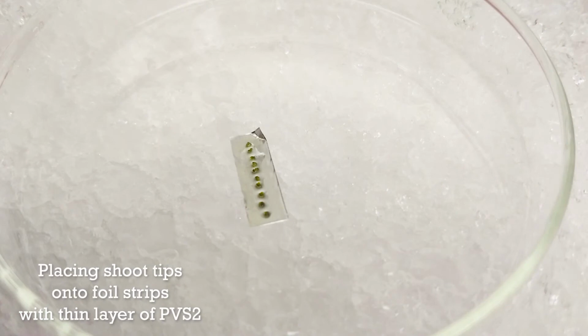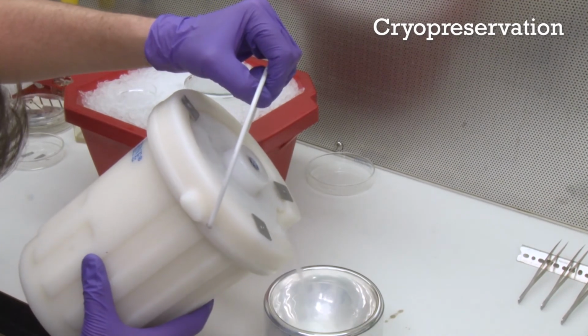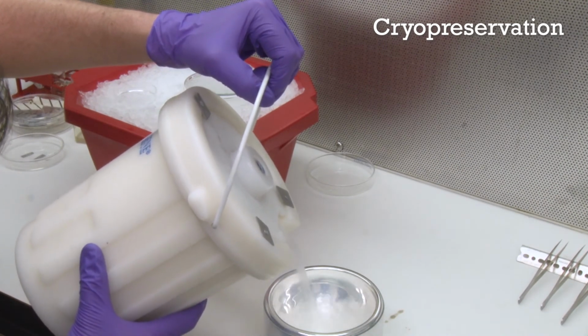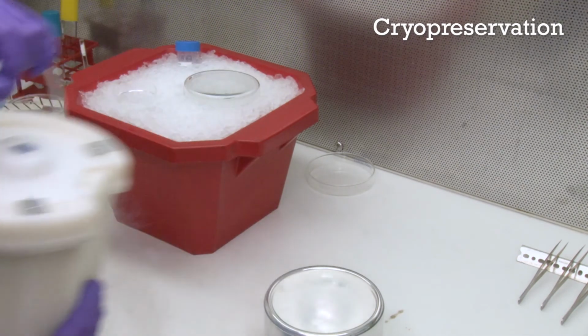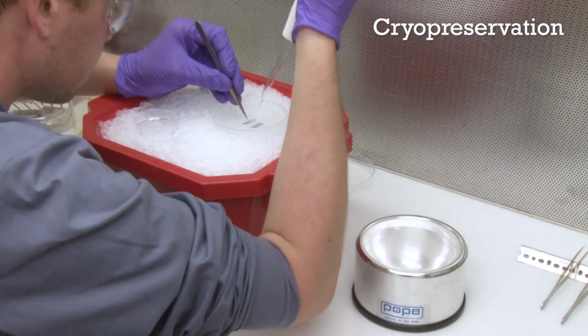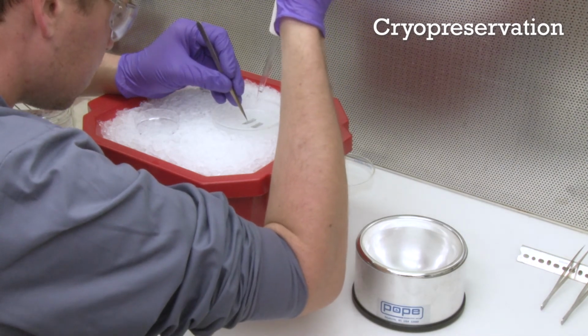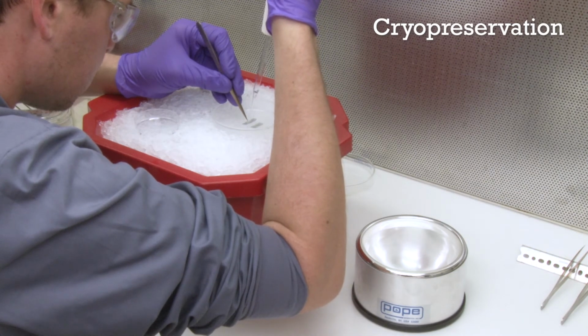There you can see all the shoot tips within the long droplet. And it is a good idea to try to space them out a little bit if you can. Once they are on the foil strip with the PVS2, you can also remove a little bit of the PVS2 so that there's just a very thin layer remaining.